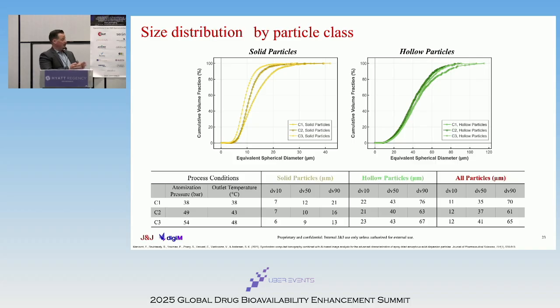We can also, again, separate these out, and we can look at the size distribution of the solid particles separately from the hollow particles. So we can get a much more granular look at how these particles are actually breaking down.